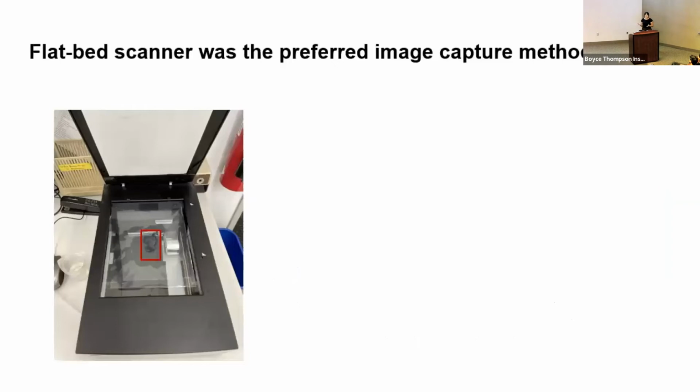So now that we had a reliable staining procedure, the next thing we did was move on to our imaging method. We started off by using a dissecting microscope, but we quickly realized that this just wasn't a feasible method for imaging. The reason being is that even on the dissecting microscope, the field of view is just far too small to efficiently visualize our roots. We would have had to take at least dozens of images just to see one root system, and because we're ultimately trying to make this a more efficient process for our lab, this just wasn't the best course of action.